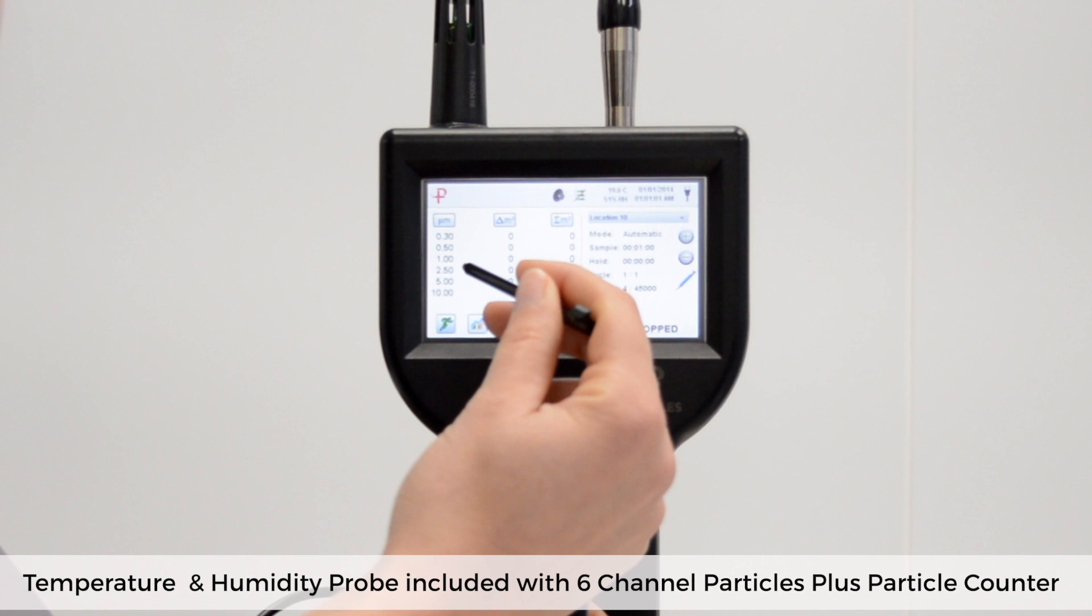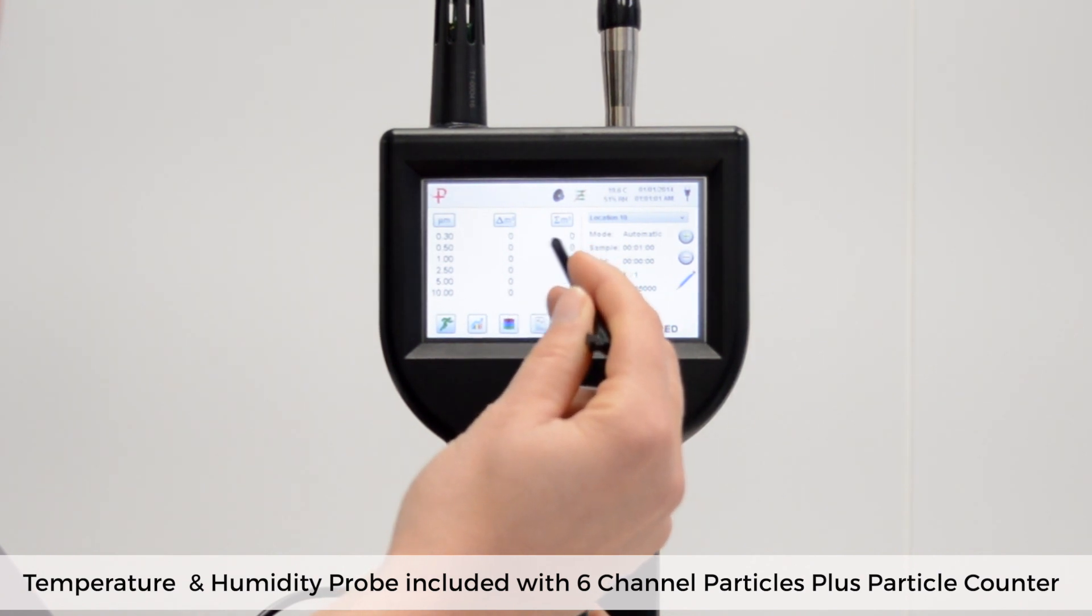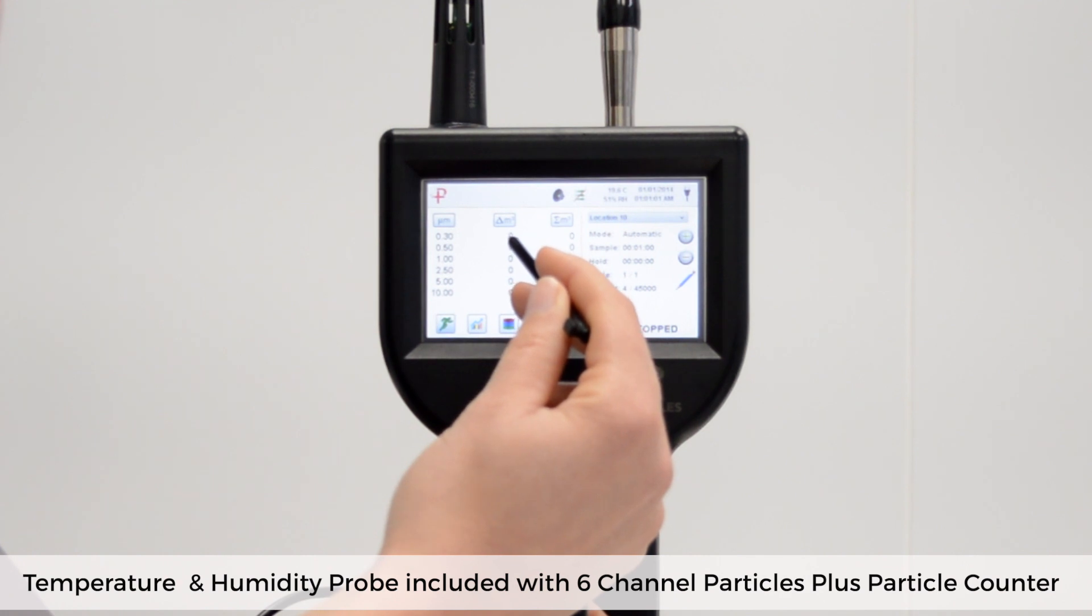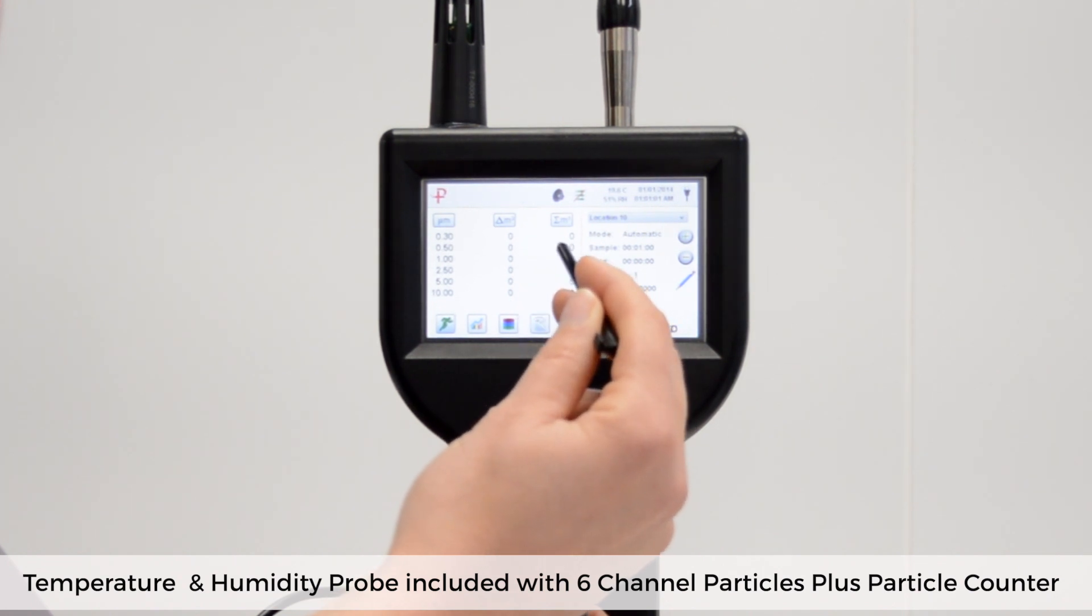Particle counters display readings in two columns, differential and cumulative. The second column with the delta heading shows a differential total which is the number of particles which are at least that size in diameter and up to but not including the next size. The third column with the sigma heading shows the cumulative total which is the amount of particles that were found at that size and greater. It is a cumulative column which the ISO standard relates to.